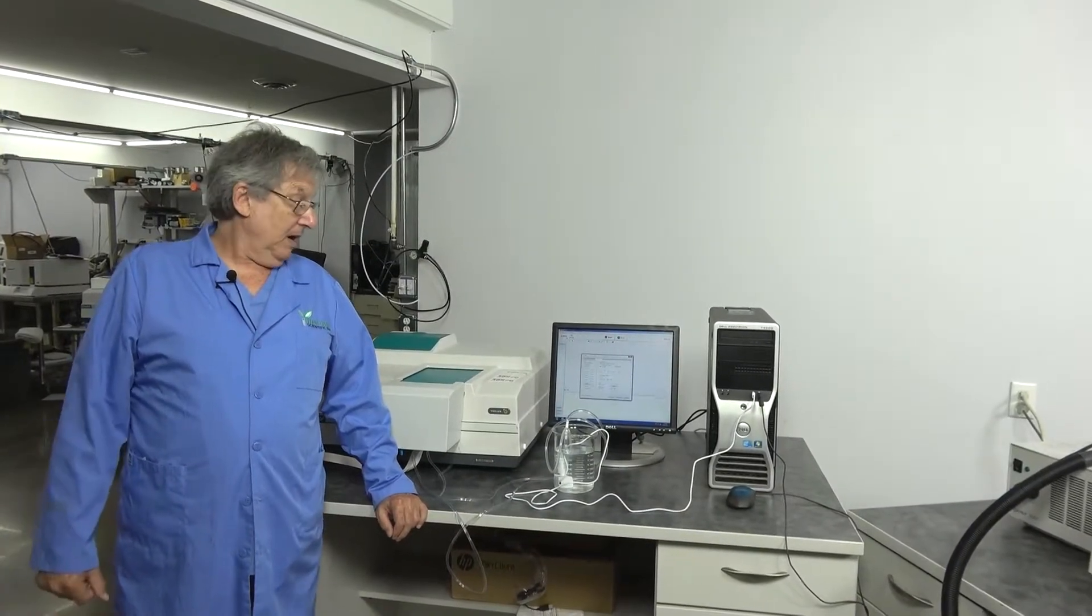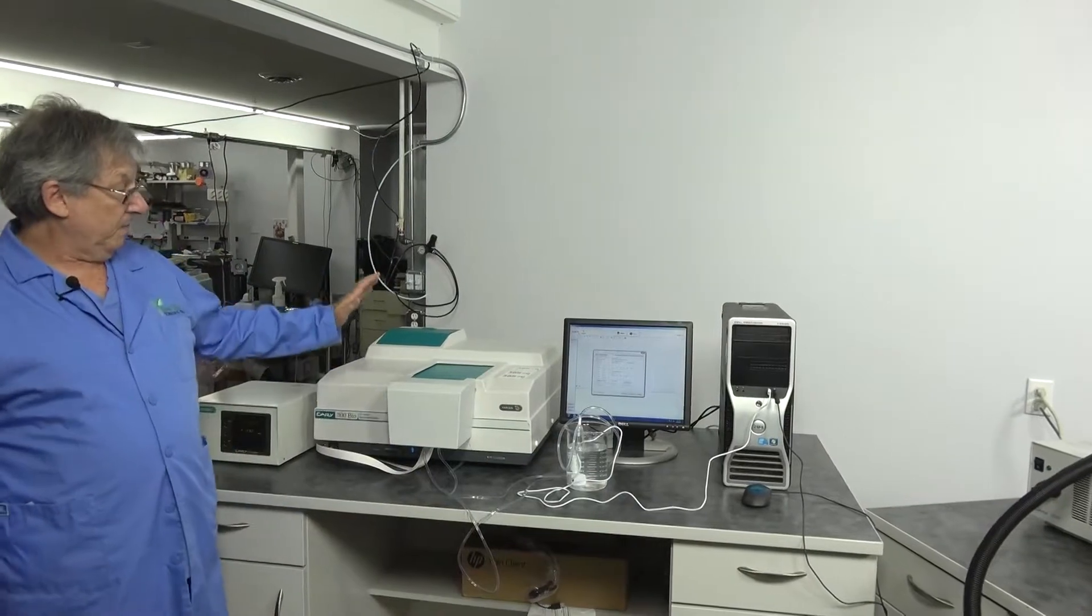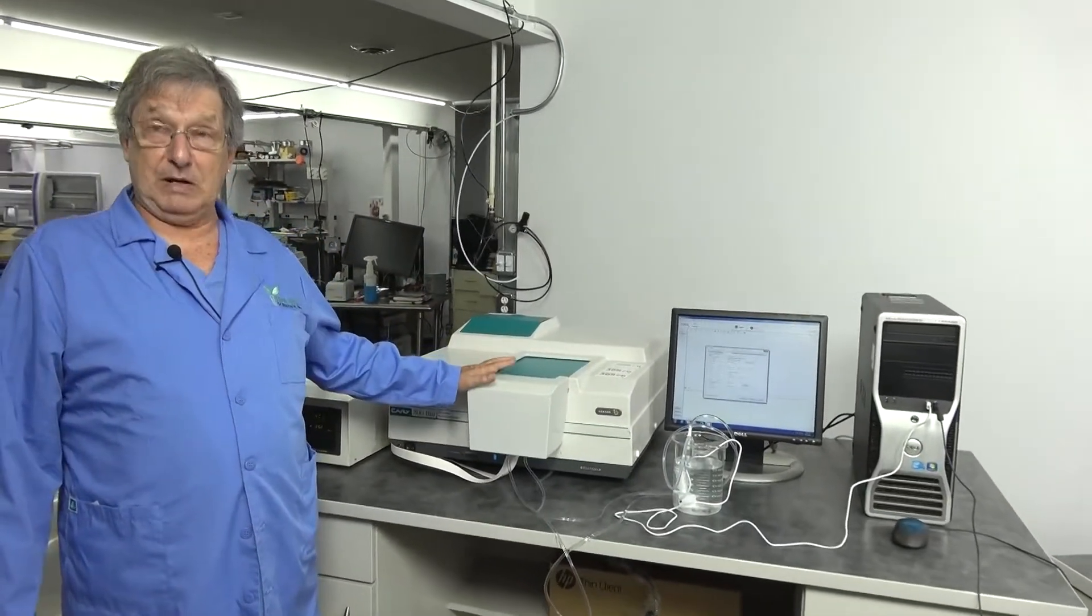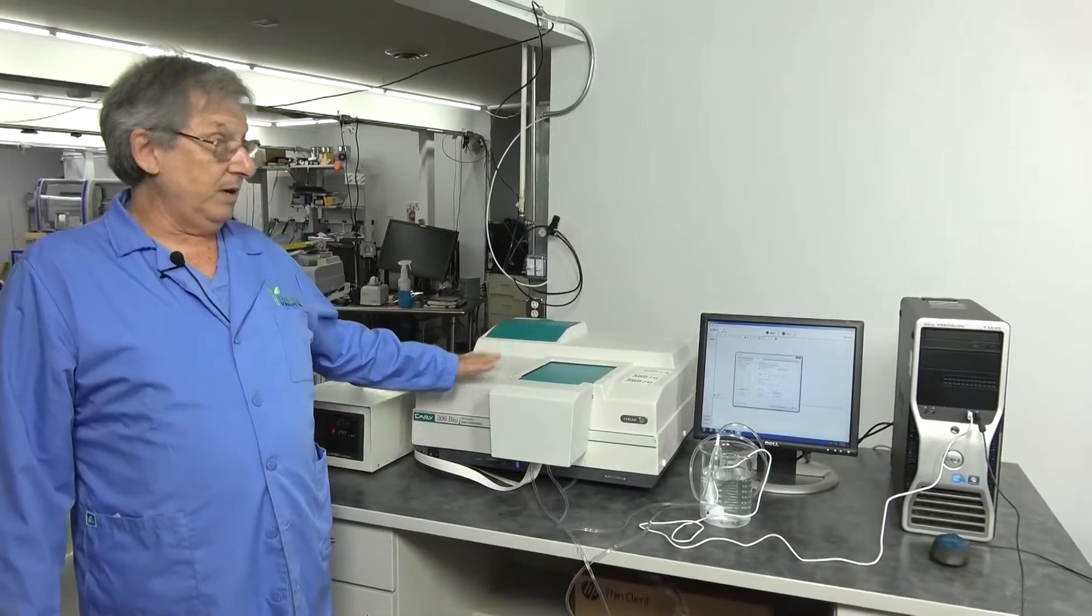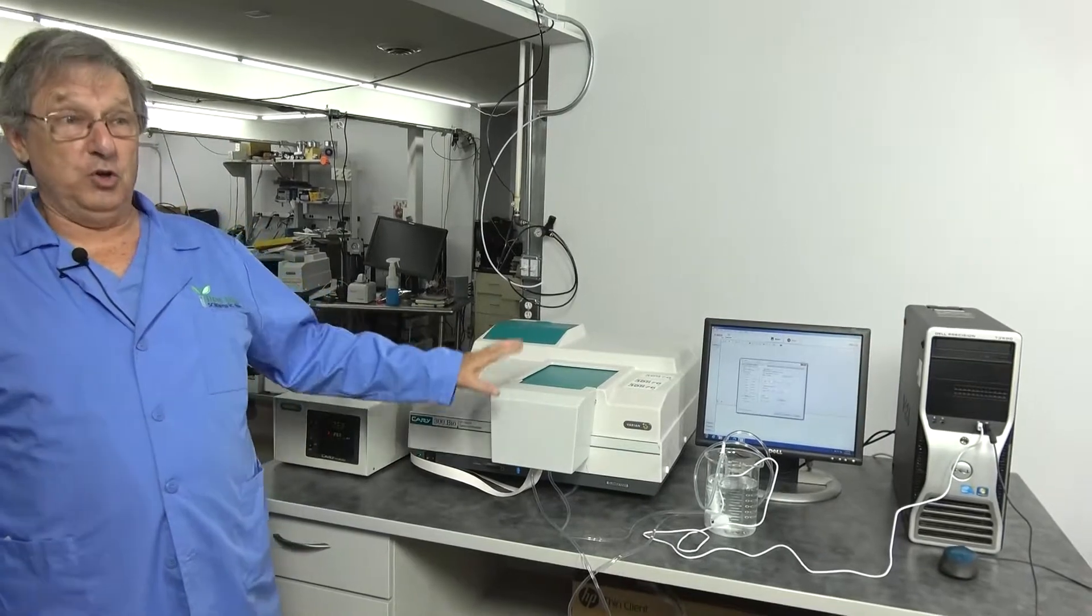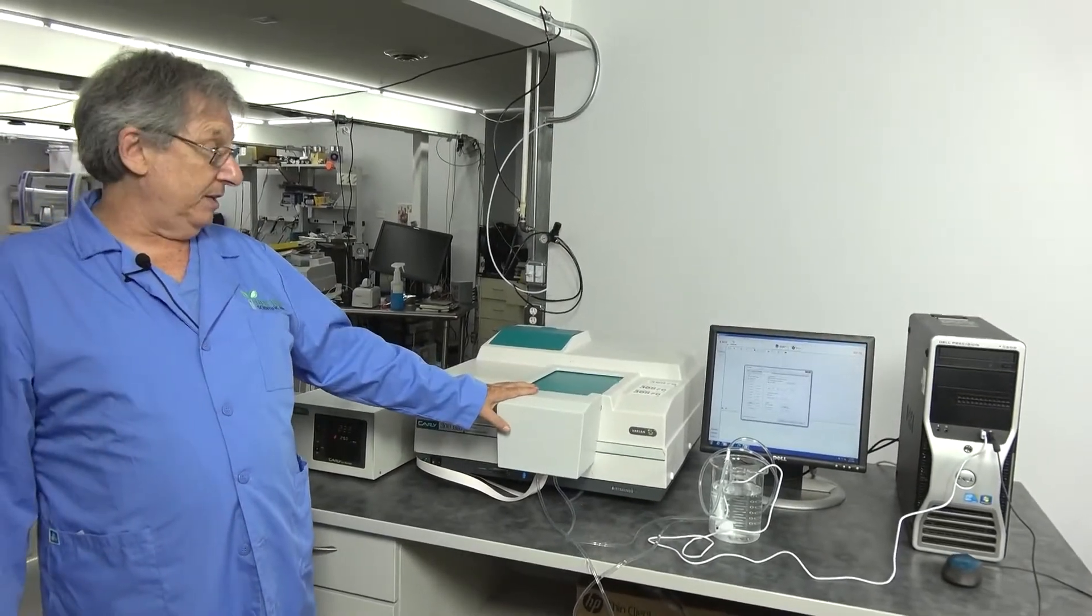Welcome to New Life Scientific and the Tech Shop. Today we're going to talk about accessories for the Varian line of spectrophotometers, the 100 and 300 line. Agilent has the line now, and these accessories do work with their brand as well.